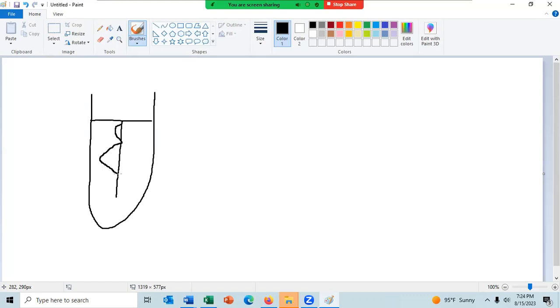There'll be different sizes, different pattern on each side. So let's make it like that. Then make a real big one here. And maybe a little one right there. That's the flare. So it does grow on the stab. I'll try and make it dark there, but it flares out of the stab. And that's trying to show you a flare.